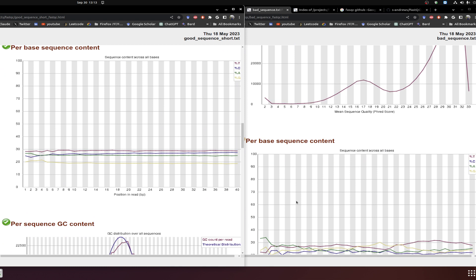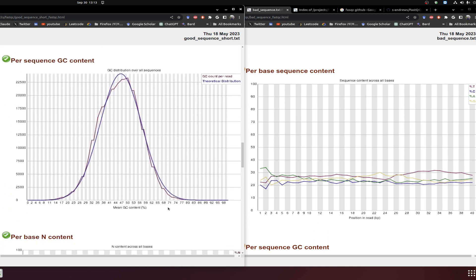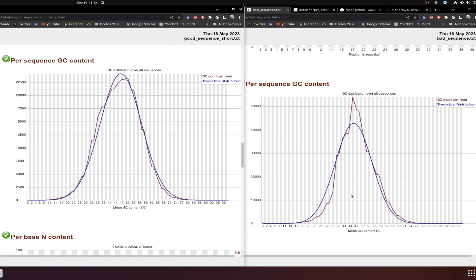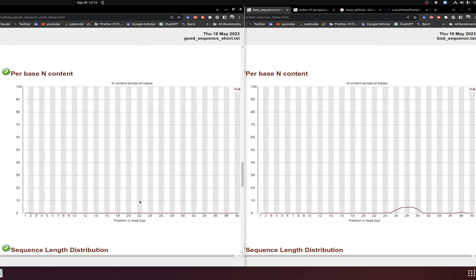Base sequence content assesses the base proportion of A, T, G, and C at each position. If there is no contamination or library preparation issue, we expect a balanced proportion. Unfortunately, if there are issues, it won't look balanced. For GC content, if there is biased GC content, there will be bias in expression analysis. The theoretical distribution and GC content per read should be synchronized, but discrepancies indicate problems.